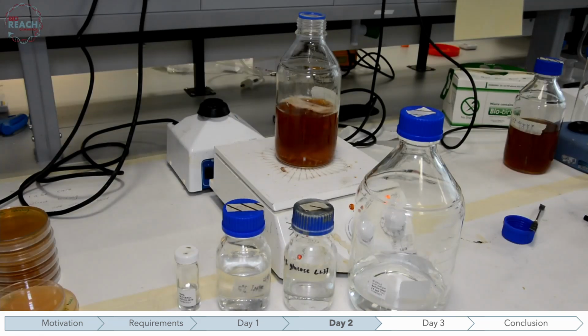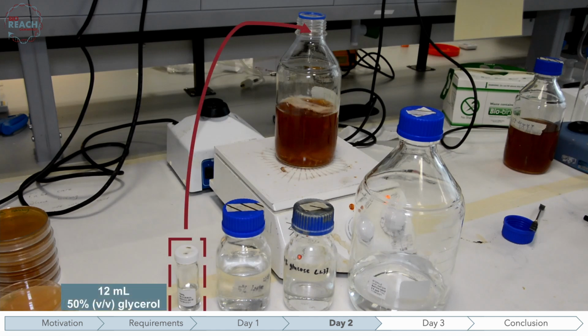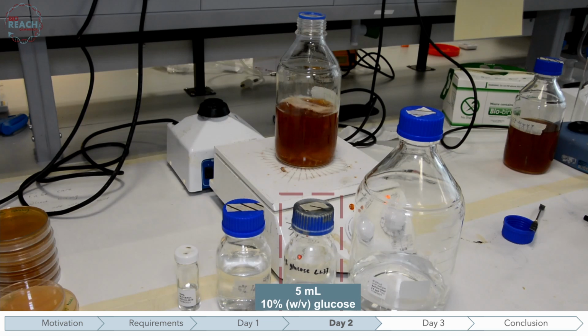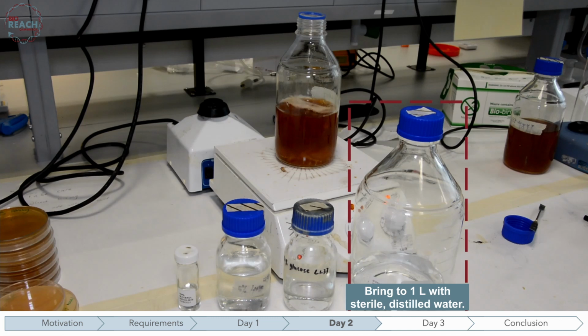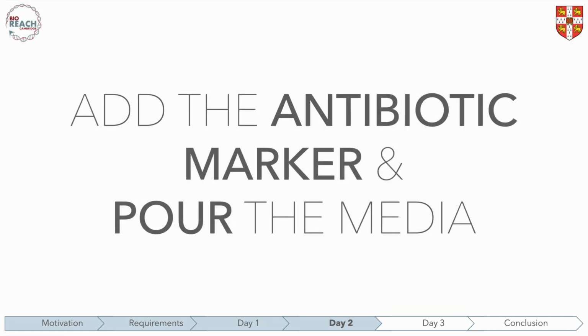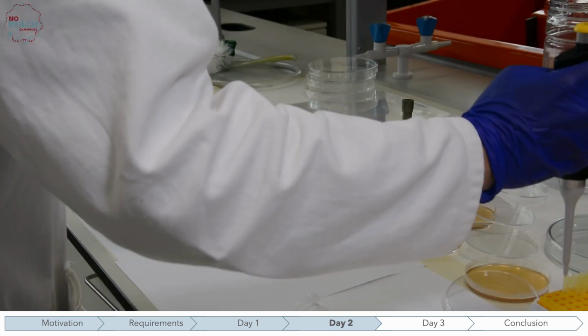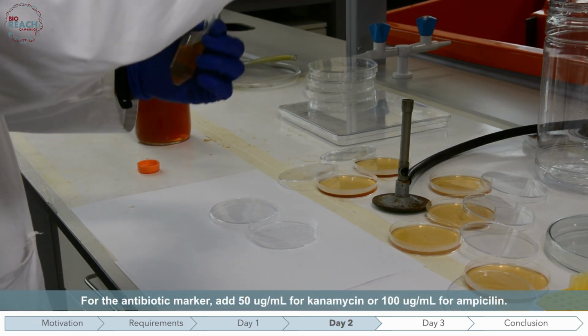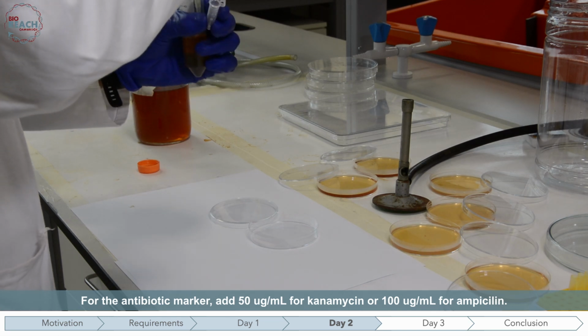Now, to reconstitute the medium, add 12 ml of the sterile 50% glycerol solution, 40 ml of the sterile 5% lactose solution, and 5 ml of the sterile 10% glucose solution. Bring the reconstituted medium to a total volume of 1 liter by adding approximately 440 ml of sterile water. Using either a lit Bunsen burner or a sterile flow hood to prevent contamination, prepare your agar plates. Add the antibiotic marker to your agar medium and mix.